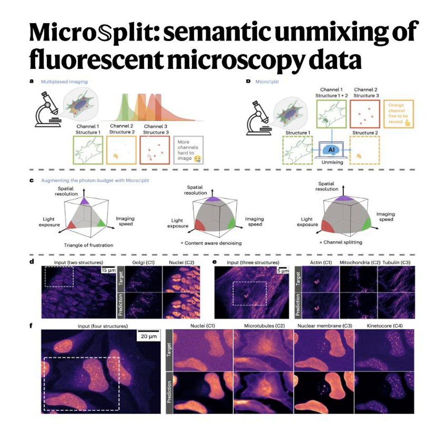Well, if you're in the lab right now staring at an overexposed, cooked sample, you know exactly why they did that. Because handling the inherent photon shot noise in biology is actually a much harder obstacle than identifying the geometry of the shapes themselves. Exactly. If you can't strip away the noise, the semantic shapes are completely lost anyway. And the empirical evidence of this working in tandem is just staggering. Let's look at the case study they ran.